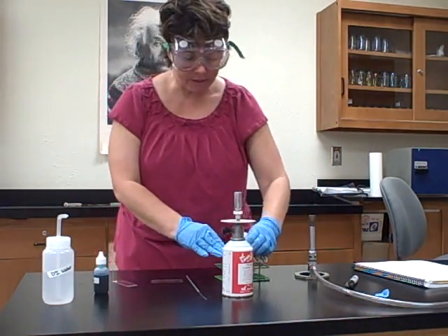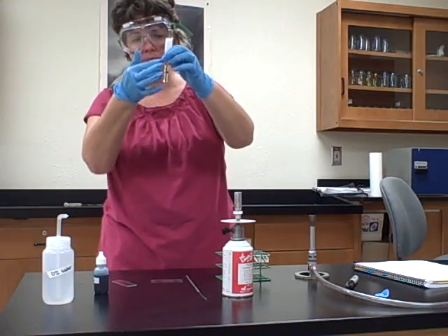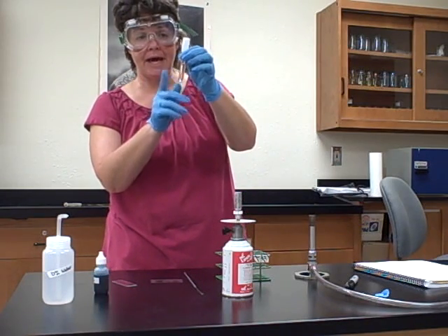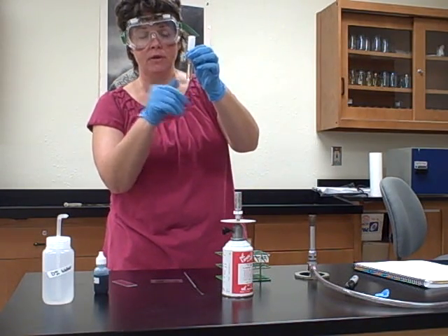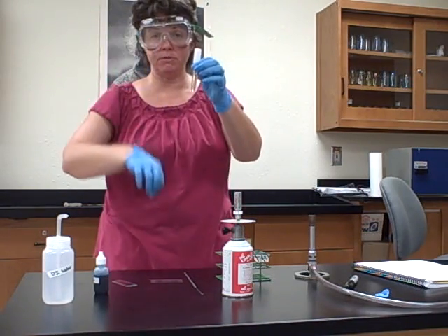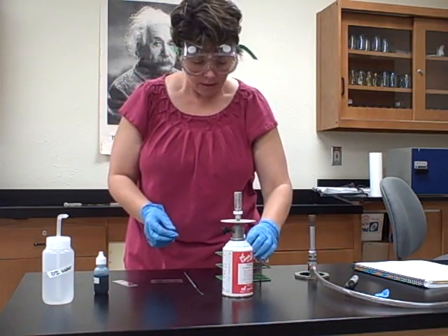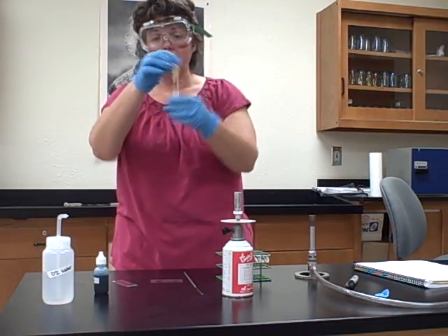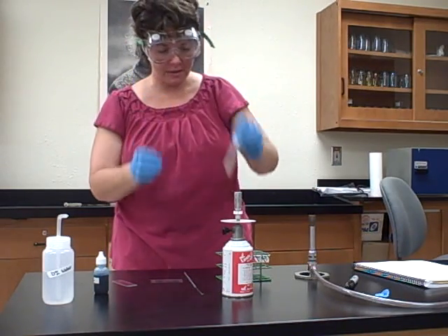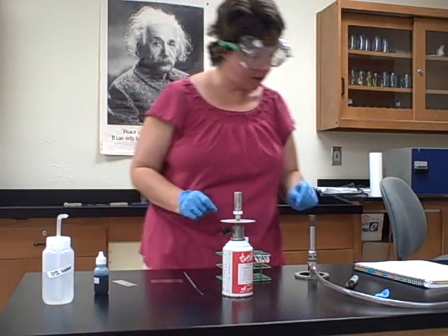We have our bacteria in two different media. This one is a liquid media. Sometimes bacteria fall to the bottom, so to get them up so you can pick them up with a loop, give it a tap and get a whirlpool going to bring them up. Then when you dip your loop in, you'll make sure you get bacteria. If they're sitting on the bottom you might not get enough sample. The other one is on a slant — a solid medium — and taking from a solid requires a different step. We'll do the liquid first.